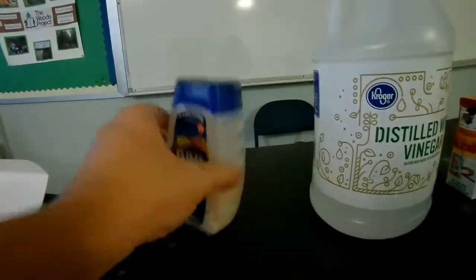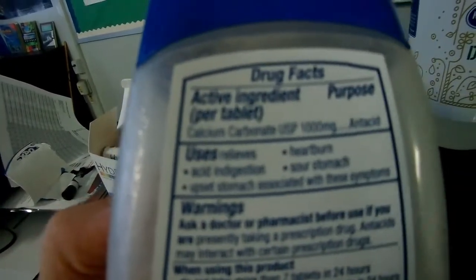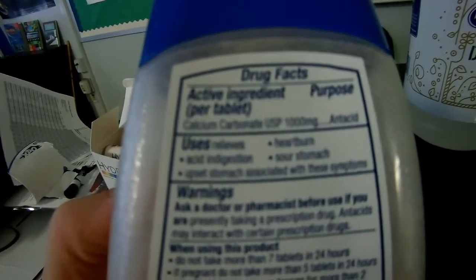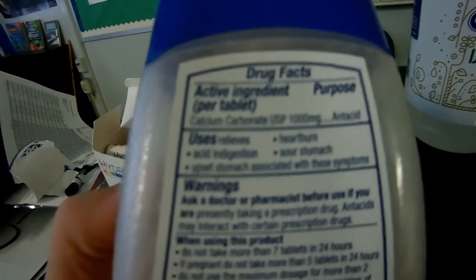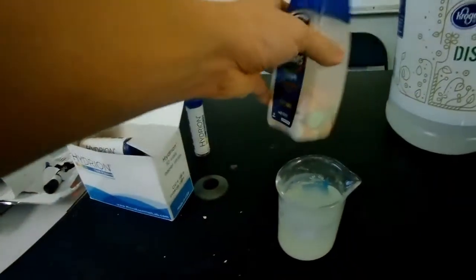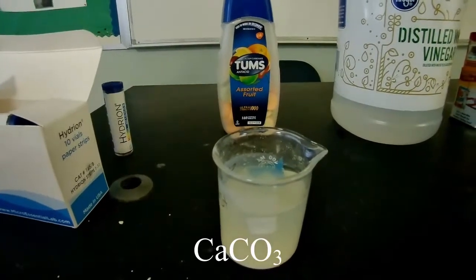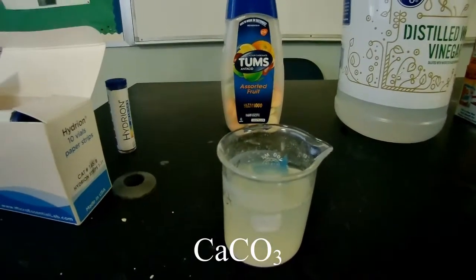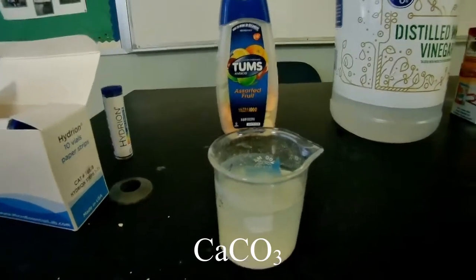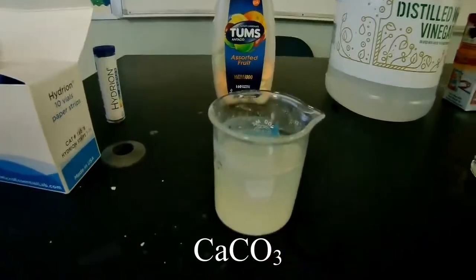One other thing, if we look at the back of our Tums container, we zoom in here. It's a little blurry, but I think you can make it out. The active ingredient is calcium carbonate. And I'll put up the chemical formula for that. The chemical formula is CaCO3. So let's make our prediction of whether or not we think Tums calcium carbonate is an acid or a base.